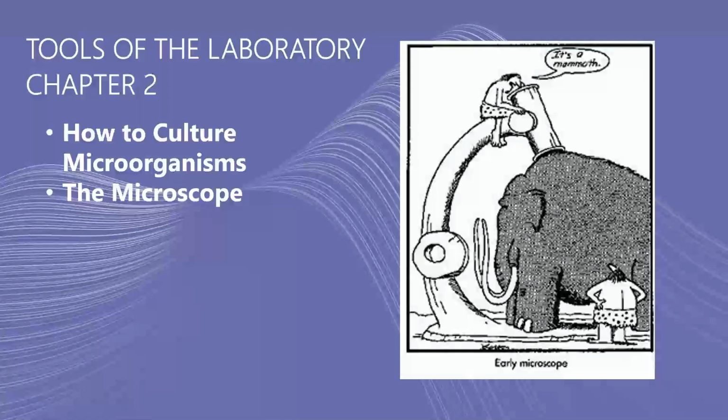Continue with chapter 2 of microbiology on what tools we have in our toolbox to study microbes in the lab. Our first order of business from this chapter is going to be, how do we culture them? How do we grow them, get enough sample to work with?